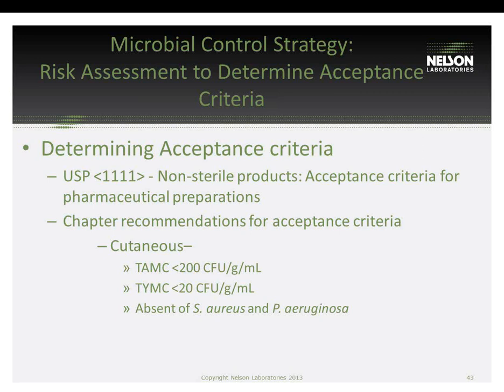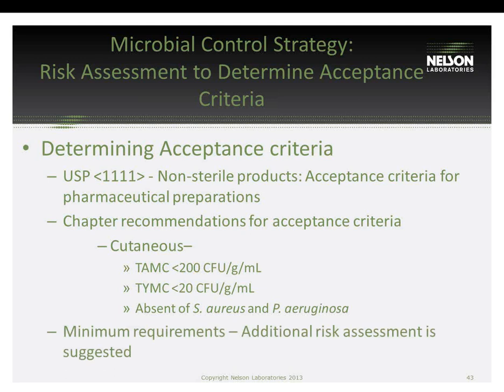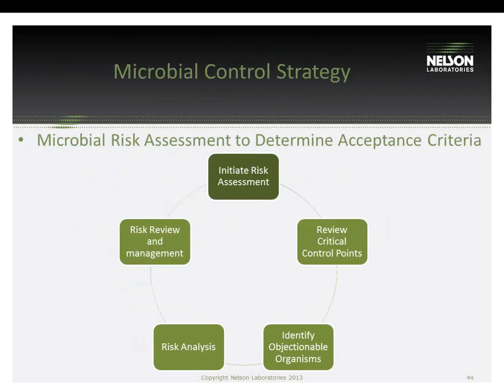Those could be common organisms that would cause infections if the opportunity arises. They're opportunistic pathogens. But these are minimum requirements. Additional risk-based assessments should be performed, and we'll cover that here.